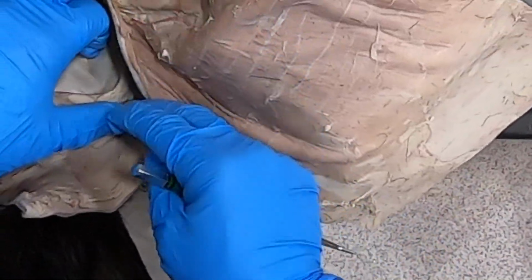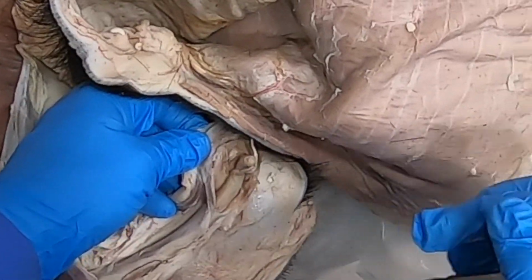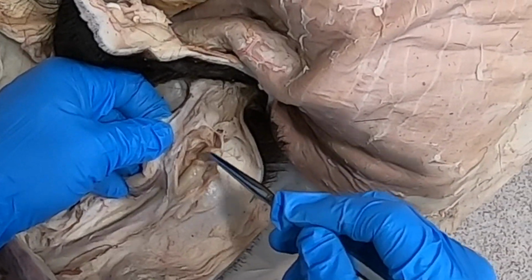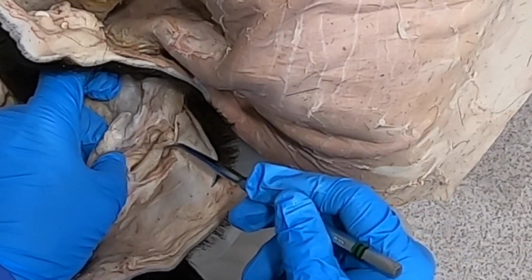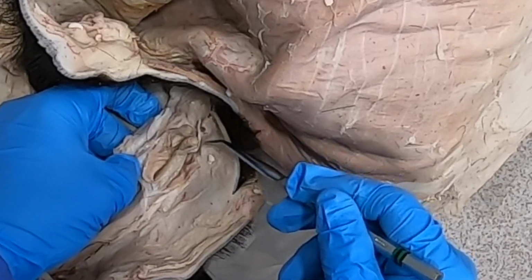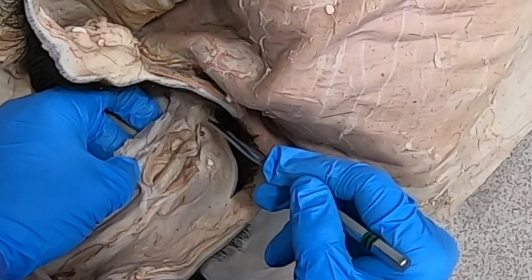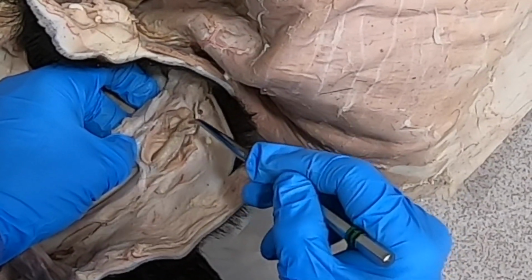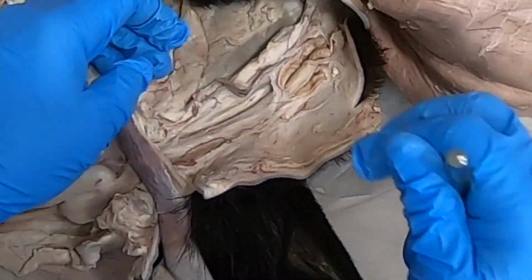And we come on down, and in our prepuce here, I've opened it up so that we could see this bulging portion here is the glans of the penis. And then this little part here is the urethral process. So this is actually an extension of the urethra that comes on out of the penis here. Okay, so that's urethral process. This is the glans of the penis, and then the rest of the penis here.